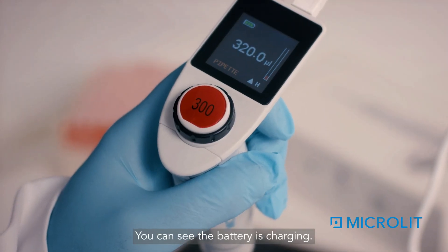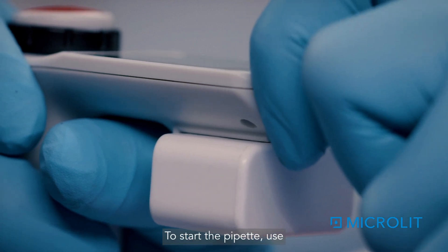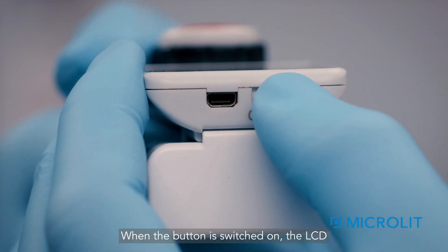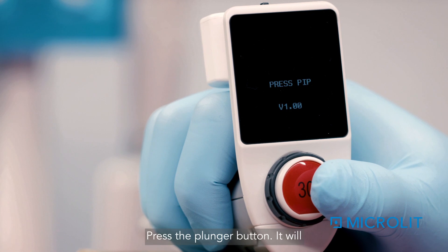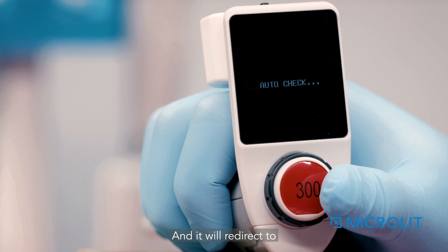You can see the battery is charging. To start the pipette, use the on/off button on the back. When switched on, the LCD will display 'Press PIP' — press the plunger button. It will indicate auto check and then redirect to pipette mode by default.